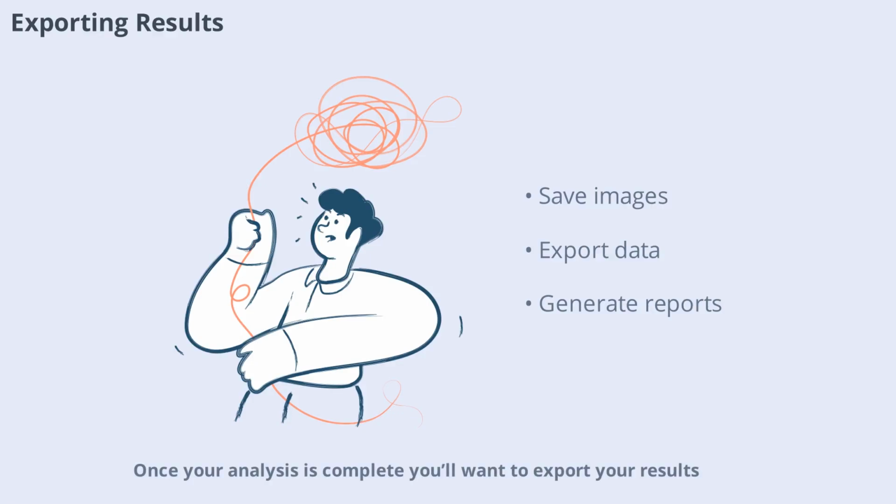Once your analysis is complete, you'll want to export your results. This could include saving annotated images, exporting measurement data, or generating reports. Choose file formats that preserve quality and are compatible with your needs. Proper documentation ensures your work can be reviewed and reproduced by others.